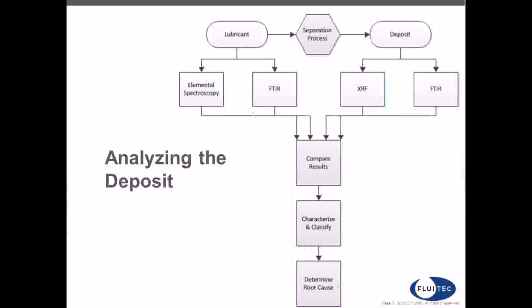And in both cases, you want to understand the inorganic or non-organic components and the organic components of both the oil and the deposits. Common tests often run to look at the non-organic components in the lubricant is elemental spectroscopy. That's a very powerful tool. And Fourier transform infrared analysis.